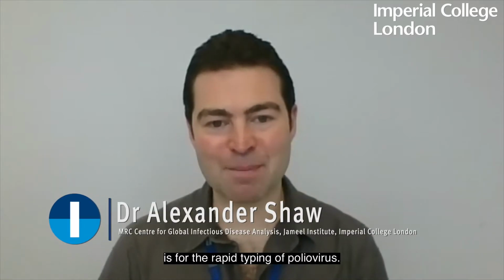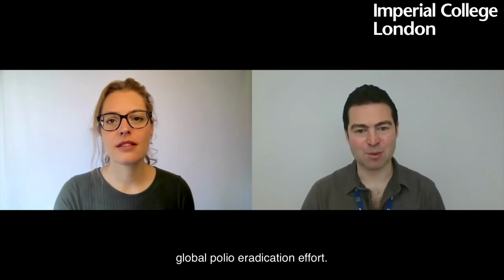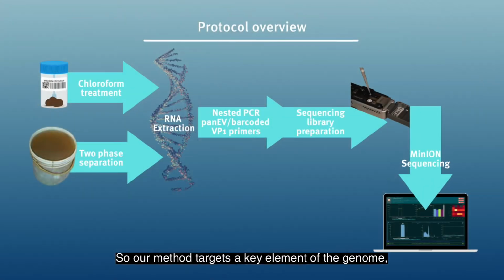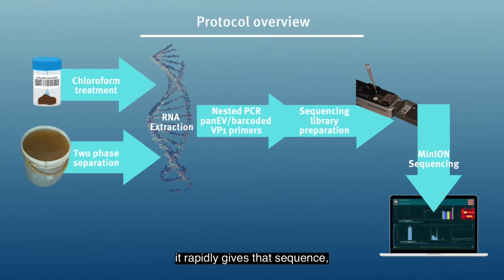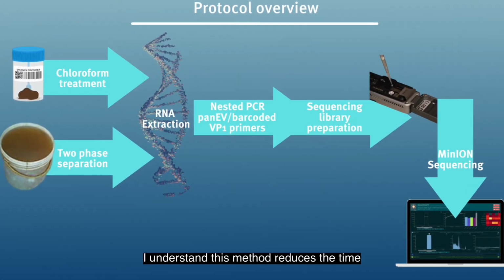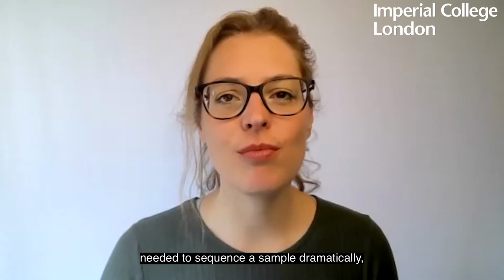This method we've been developing is for the rapid typing of poliovirus, and this has been developed as part of the global polio eradication effort. So our method targets a key element of the genome, rapidly gives that sequence, and that allows you to guide this response. I understand this method reduces the time needed to sequence a sample dramatically.